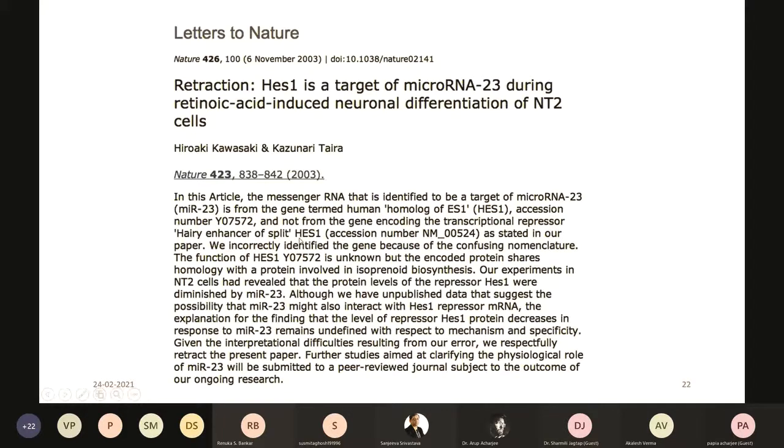So whenever you are analyzing, since there will be so many target proteins, maybe 100 or 500 or 600, it won't be possible for you to manually go and check them. Ideally, you should, but if you want to skip that step altogether, please stick with an ID that is quite universal, like UniProt.